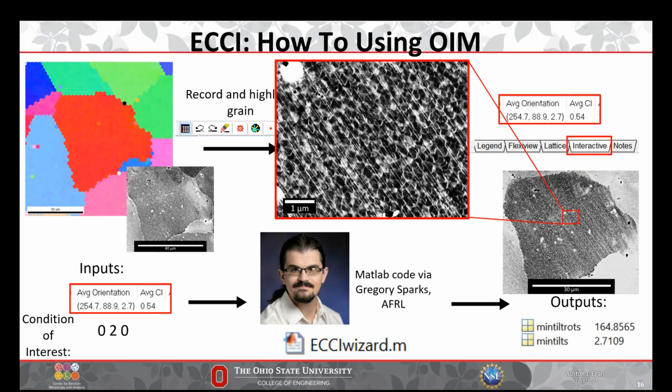So basically, it's driving the sample with tilt and rotation using matrix operations, or sort of coordinate transformations, basically in MATLAB. But Greg is the wizard that does all this in coding. I just use it. If you want to figure out how you would practically implement this in code, Greg is the guy to talk to, because that's way above my pay grade.